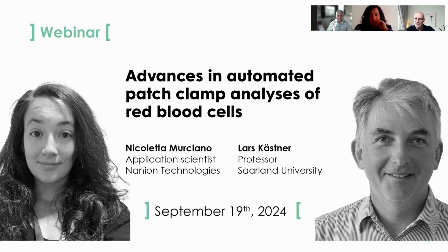Thank you. And I see Michael Netzer just added a comment. Thanks for the answers, Nicoletta. I actually was curious if the absolute Gardos currents were bigger in erythroblasts versus red blood cells. So the absolute Gardos current actually was not shown.